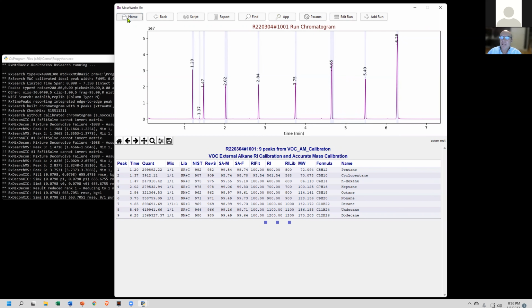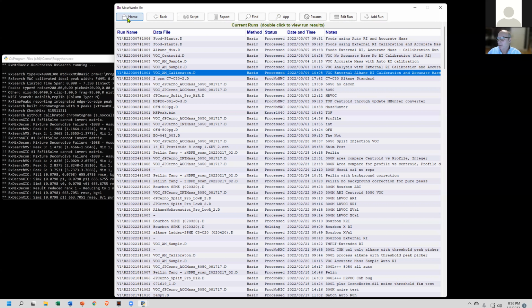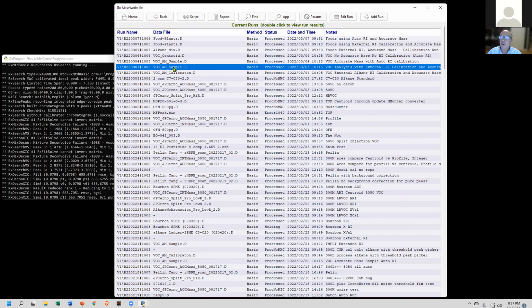Okay, so now, once I've built those calibrations, and that's a one-time thing, you'll probably need to redo the spectral calibration every couple of days. And as long as nothing changes in your GC, that would be likewise. Some people like to do it every day. Now let's go and do the analysis.